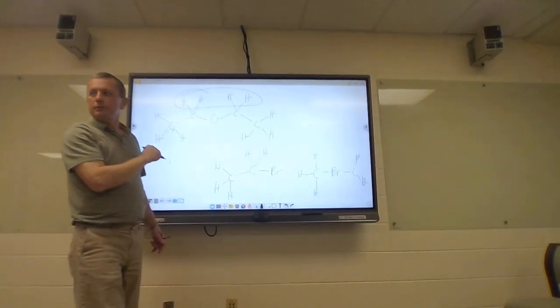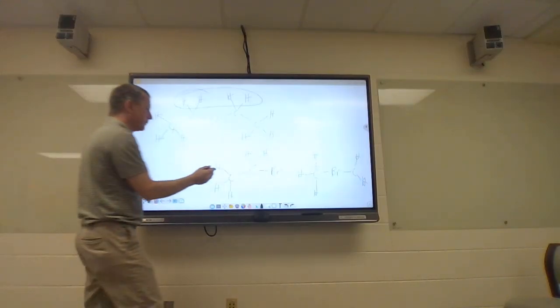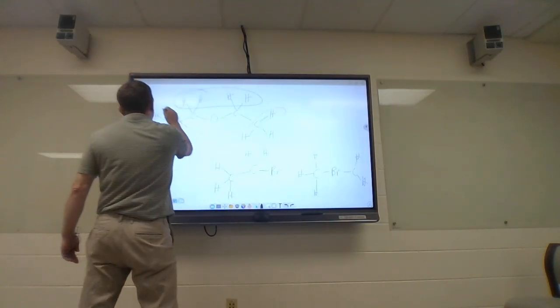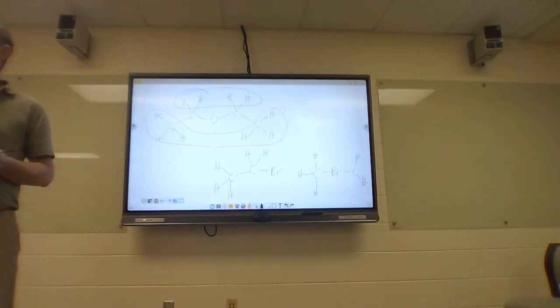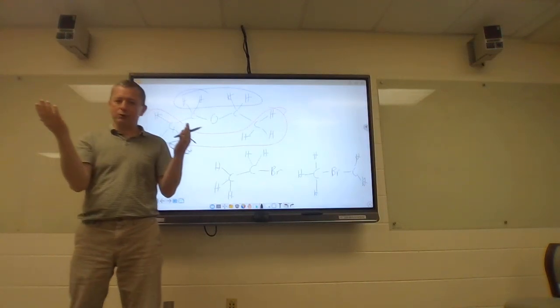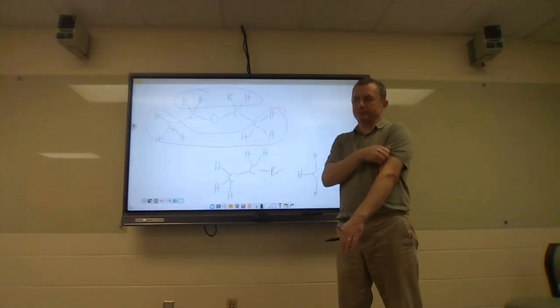These are the same distance from the oxygen, right? As well as these are now the same. So when your molecule has enough symmetry, you'll end up having basically duplicates, and your integrations will double.